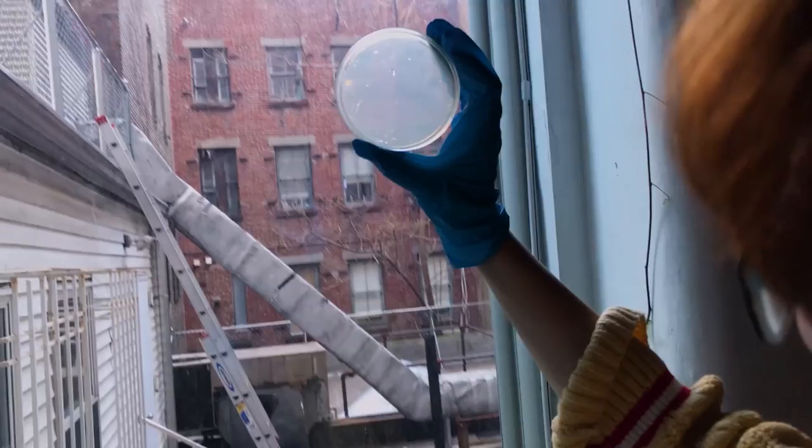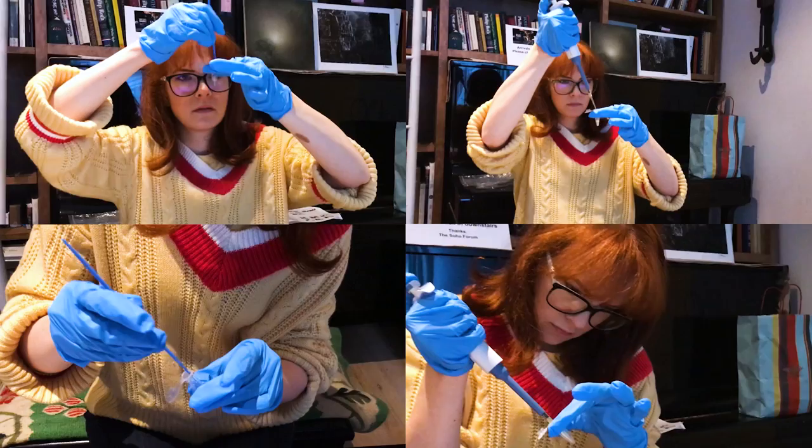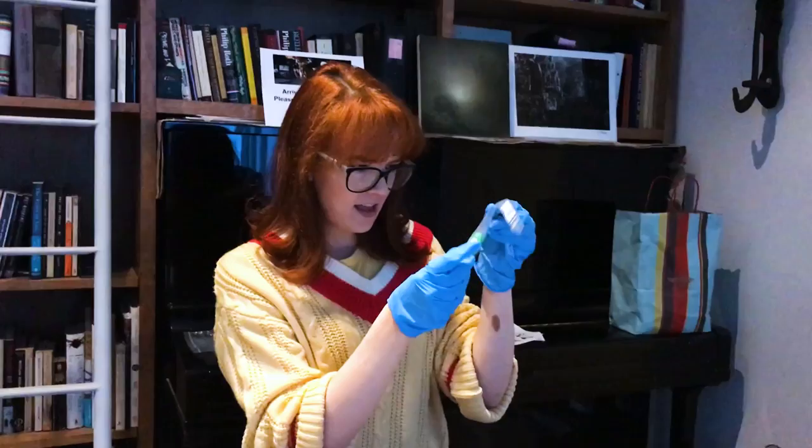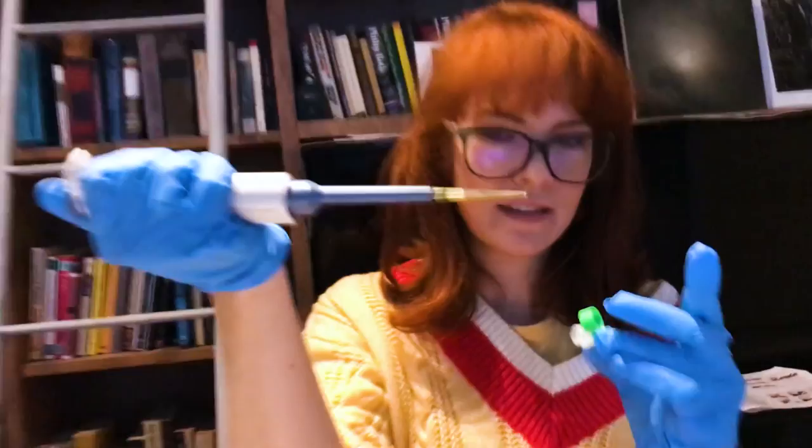We needed to make the bacteria cells what is called competent, which means that you weaken the cell walls so that the bacteria is able to intake foreign DNA. Once the cell walls are weakened, we're ready to add the CRISPR components.